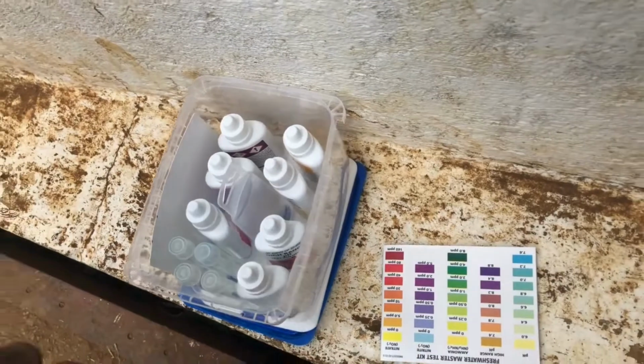Test 1, pH. pH measures how acidic or basic the water is. If the water is either too acidic or basic, it will kill the fish.